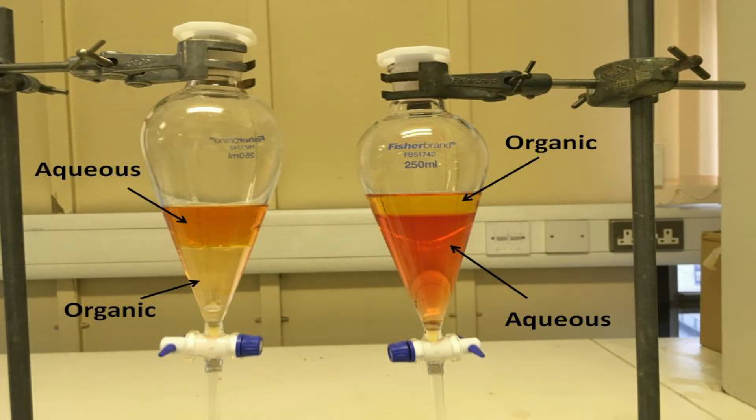For example, the separating funnel on the right has the orange aqueous phase on the bottom, and the yellow organic phase on the top, because here ethyl ethanoate has been added to our aqueous solution of water. The density of water is 1 gram per centimetre cubed, but ethyl ethanoate, our organic phase, has a smaller density of 0.9 grams per centimetre cubed, and hence the organic phase forms the top layer.